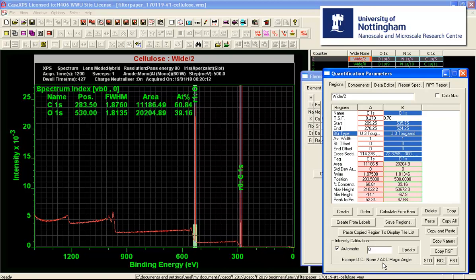The angular distribution correction is also part of these sensitivity factors, so this should indicate magic angle, meaning no additional correction will occur when these sensitivity factors are loaded from the element library. As it stands, we feel comfortable that the sensitivity factors and corrections are all appropriate for these data, giving reasonable results for this spectrum. It's also worth noting that hybrid mode is optimized for sensitivity, and any transmission differences observed are due to the lens system optimization for best signal on the given instrument.